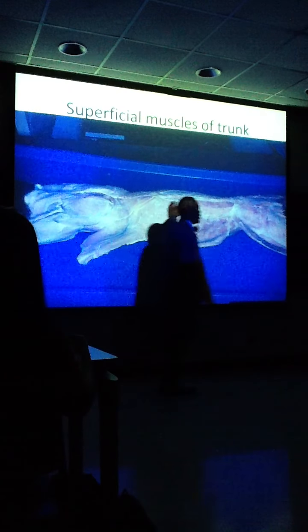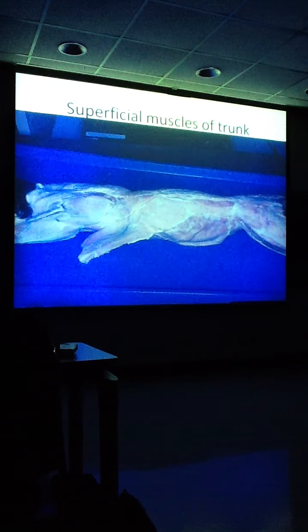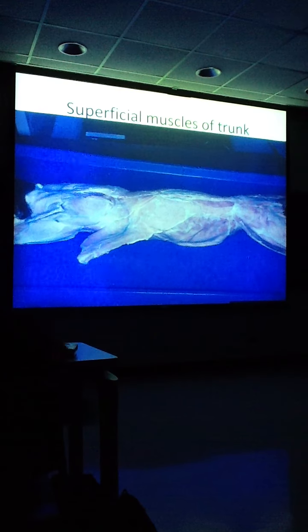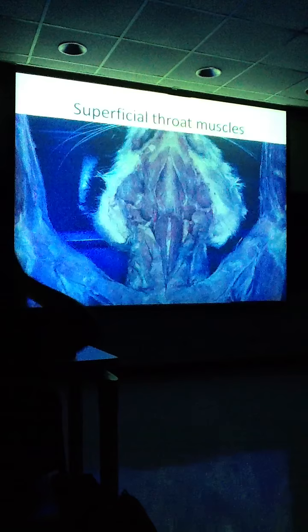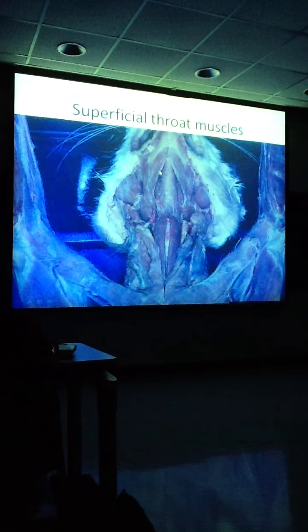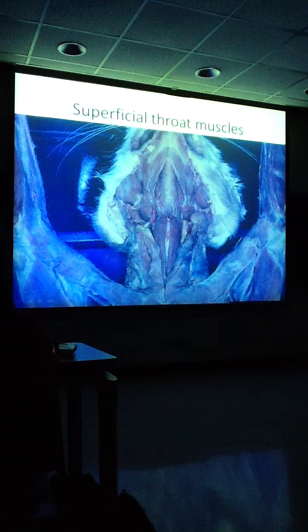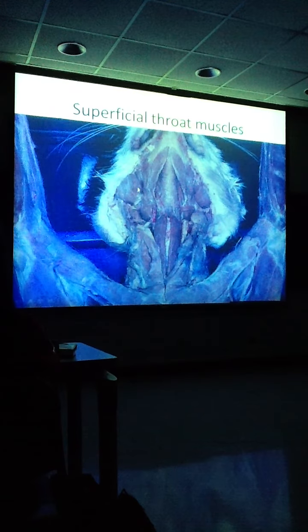Mr. Gilmore, this long muscle that's hanging there, we know his name is latissimus dorsi. If that much is true, Mr. Gilmore, we need to now look at this throat. Now, I'm going to try this with the arrow, so hopefully that'll be better. Here's what I got. I got this large muscle right here, and I got this large muscle right here, Mr. Gilmore. Those large muscles, those are called what?